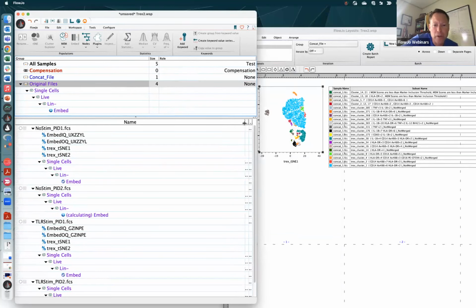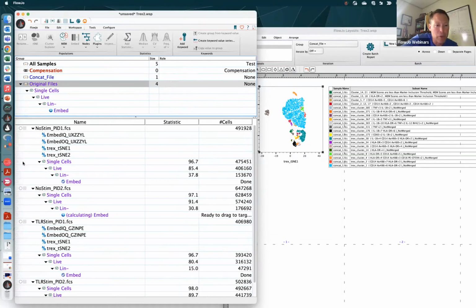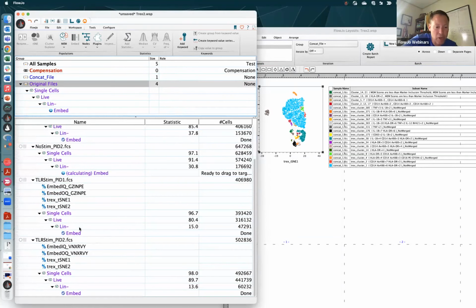I should mention also that you can drop it, as I've done, to a specific population. So I've dropped it on the negative. I don't really care about the things upstream of it. Cool. It'll just give a -1 score to everything that I did not bother to actually apply it to. All right. Of course, it picked patient ID 1, and patient ID 1 is the first two things to work on, but there we go. We finally got a patient ID 2 going.